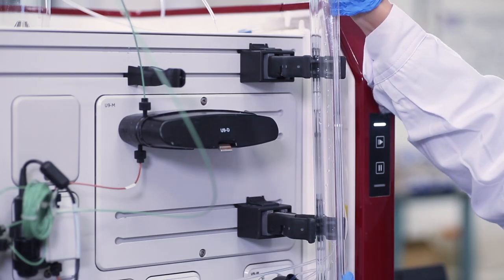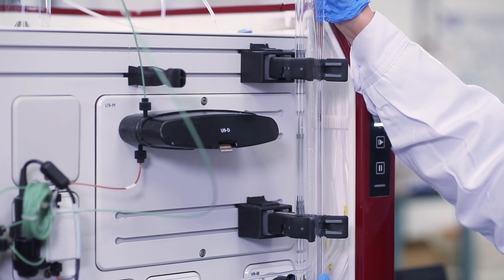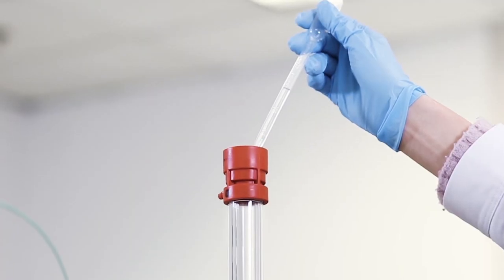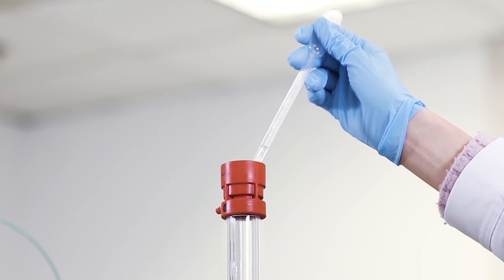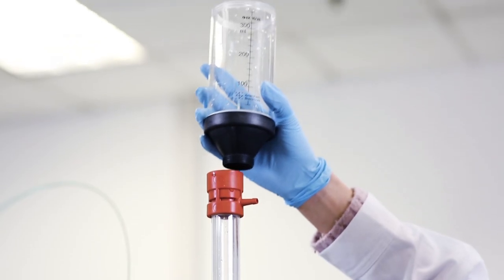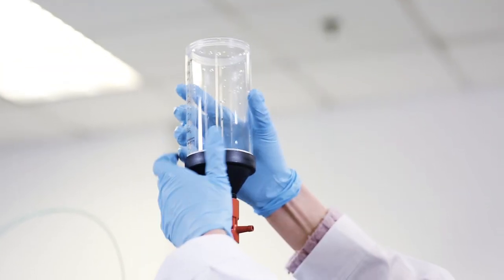Mount the assembly onto the chromatography system. Add 20% ethanol or distilled water into the column to a height of 2 to 3 cm. Attach the packing reservoir and tie it securely.